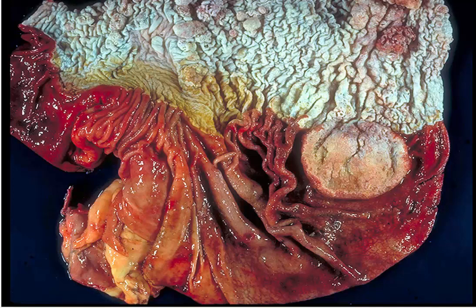Okay, time's up. This one is a little tricky. Here is the squamous portion of the horse stomach, the glandular portion of the horse stomach, and then we have this big extension of what appears to be squamous epithelium.